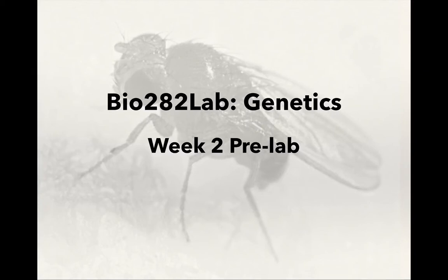Welcome to your Week 2 pre-lab. In this lab, you're going to be learning more about Drosophila, the organism that you will use as the basis for Project 1.